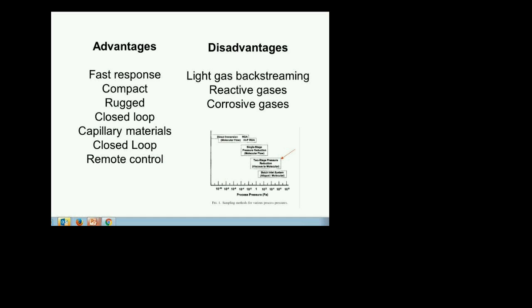Yep. And then, how do you look at total hydrocarbon, total organic? Do you look at 45 AMU for organic content? I don't know yet. I'm about to build that system. Yeah, there is a lot in the literature about this, particularly for the level of cleanliness you're going to be looking at. It's very common to do what's called a total organic content.